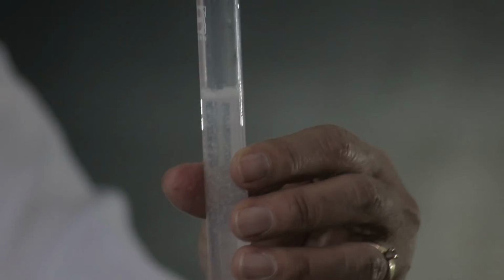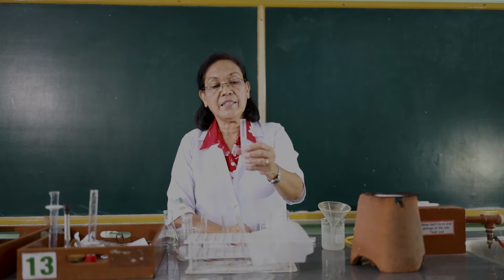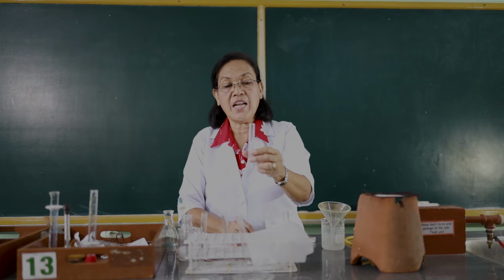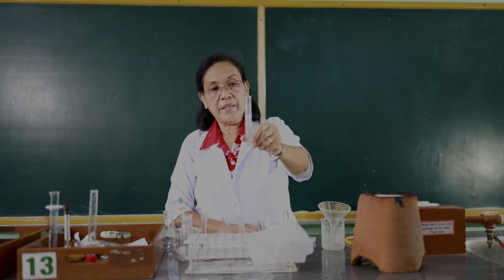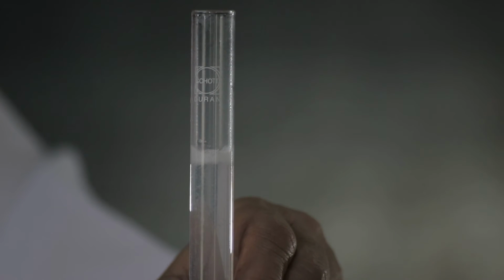So it starts to form bubbles now, and let us try to take the time whether these bubbles will burst after 1 minute or not. Okay, 1 minute had passed and the bubbles are not burst. In this case, I used 14 drops of the soap solution.